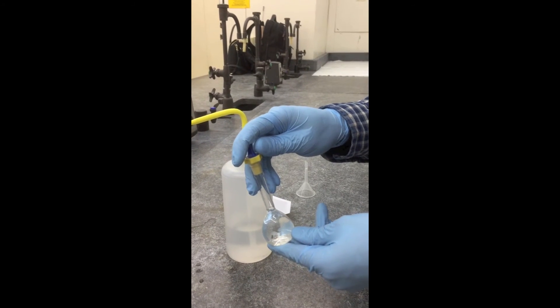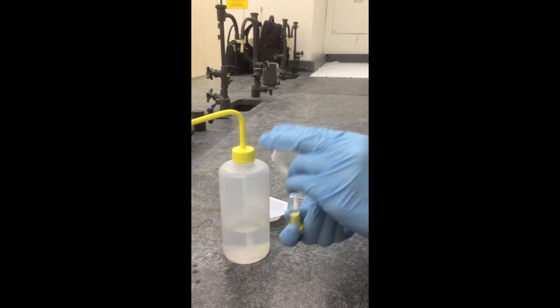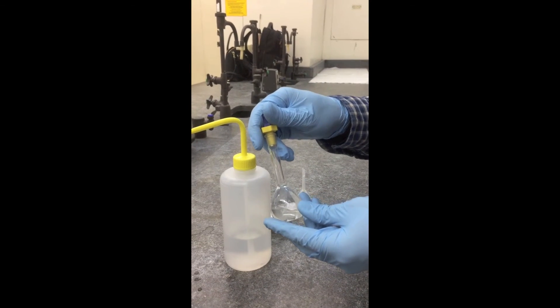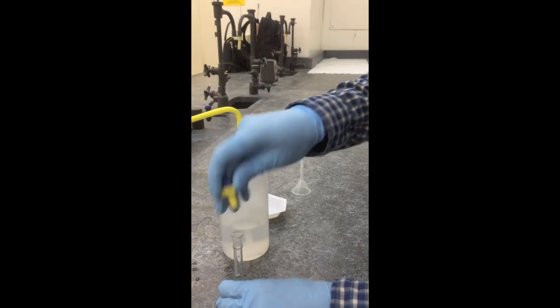Once all the solute has been dissolved, one can then add the remaining amount of water ensuring the meniscus is level with the volumetric calibration mark.